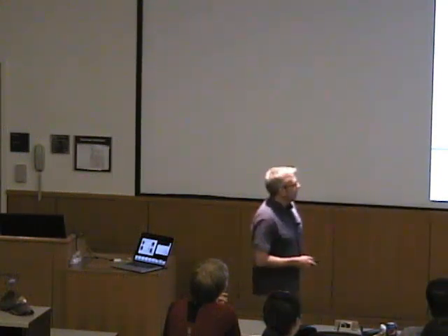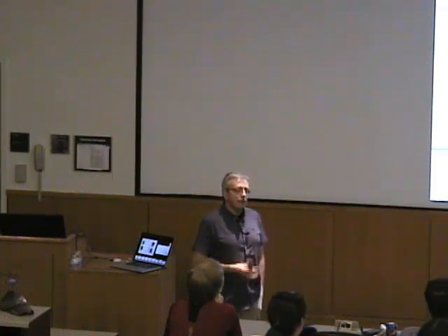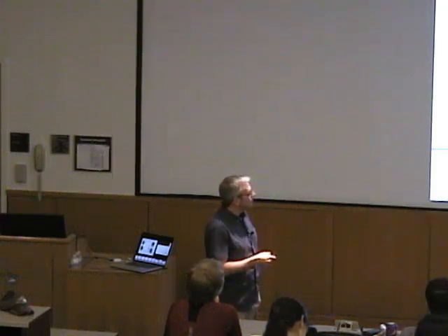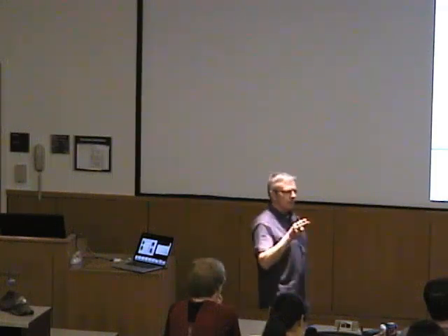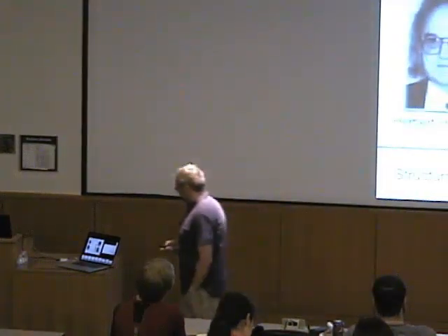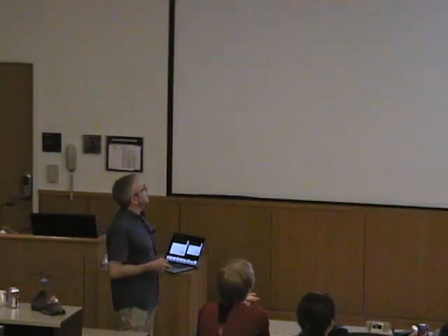Okay? We cannot measure the phase angles. That's a real pity. But what's even worse is that the phase angles contain the bulk of structural information. So, I mean, it's all a bit washy, but you clearly recognize the source of the phase, not the source of the amplitudes. Okay? Electron microscopy is better in that. They can determine the phase better than the amplitude for different reasons, but for us, this problem is a real problem. Okay. So what we need is quite obvious. We need a way to determine phases, something like a phasor or so.